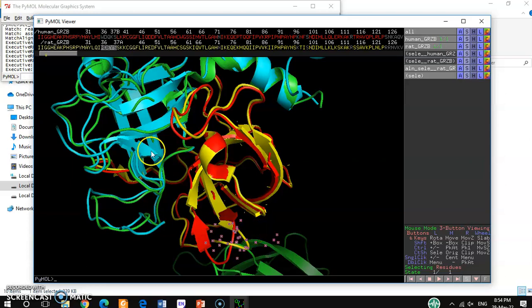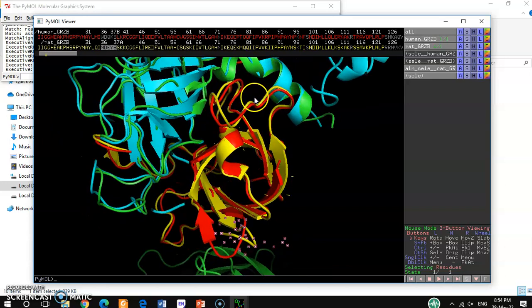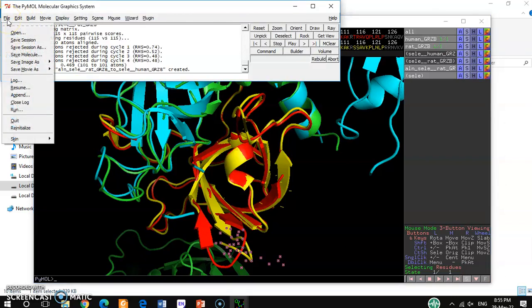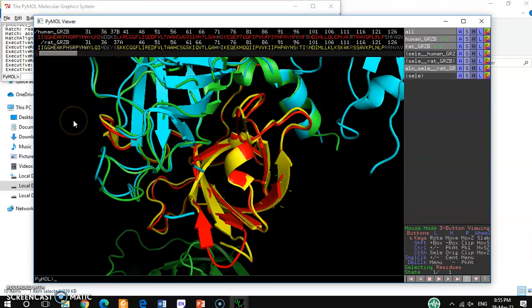This is how you can align any 3D protein structure in PyMOL. After alignment, it is actually very easy to do. You can also use these alignment figures for publication purposes. For that, you can save the image as a PNG file. This is very useful to know.